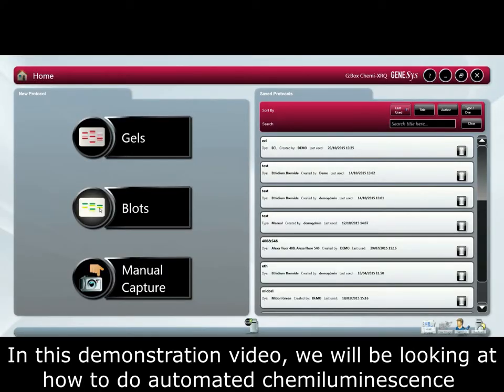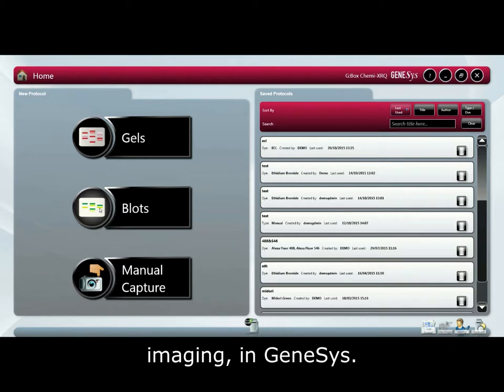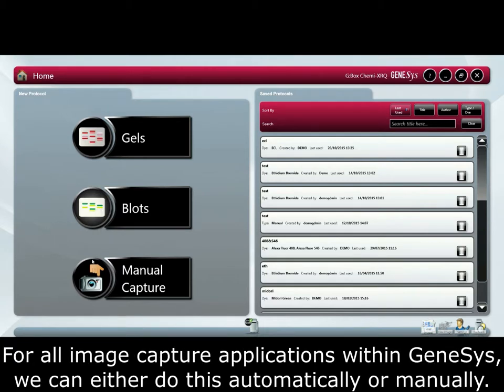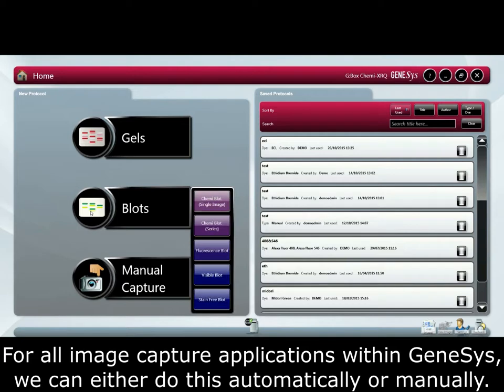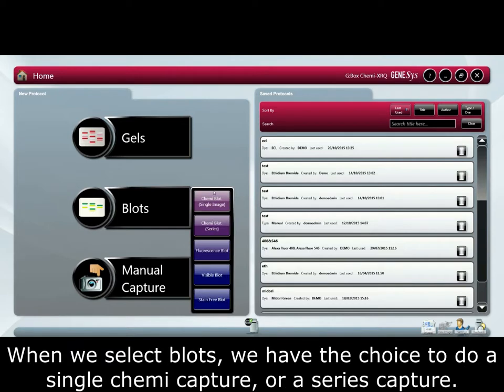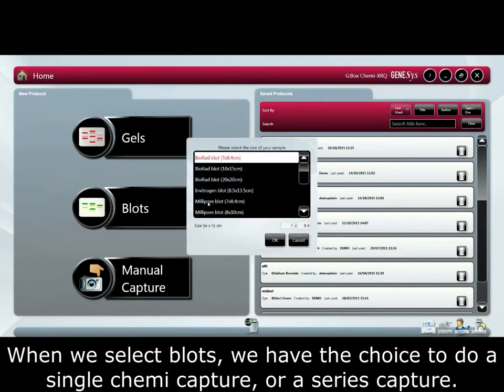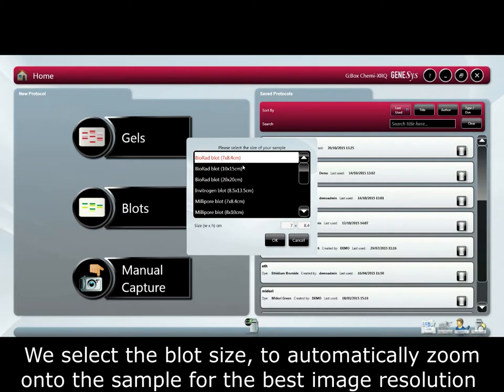In this demonstration video we will be looking at how to do automated chemiluminescence imaging in Genesis. For all image capture applications within Genesis we can either do this automatically or manually. When we select blots we have the choice of doing a single chemi capture or a series capture.